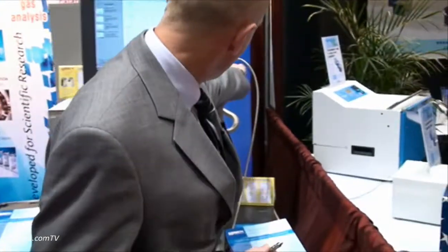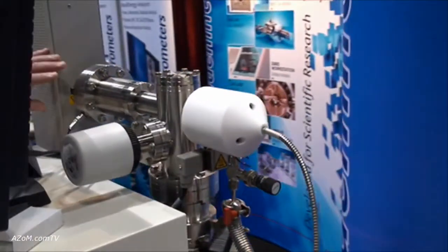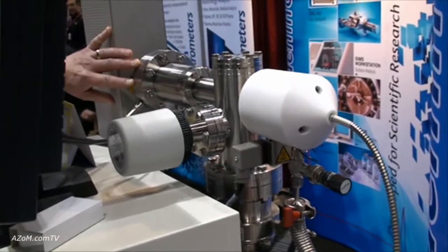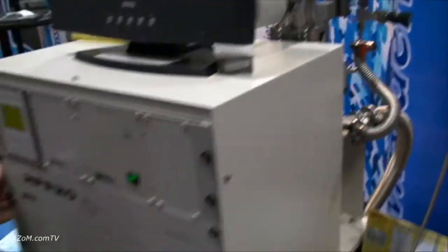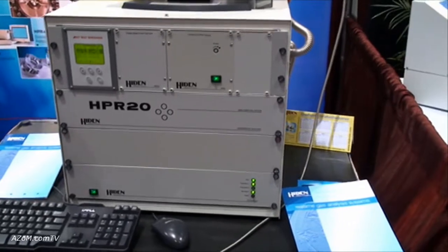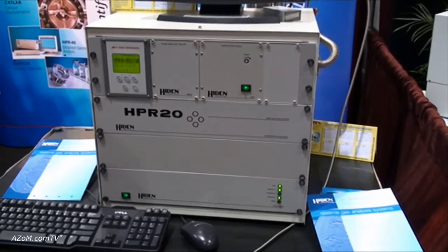The gases are injected into a quadrupole that's in its own differentially pumped vacuum manifold. This is a triple filter quadrupole, 300 atomic mass units, driven with a high power RF generator and connected to our own dedicated micro control system, run over RS-232, USB, or Ethernet LAN back to a PC running XP.